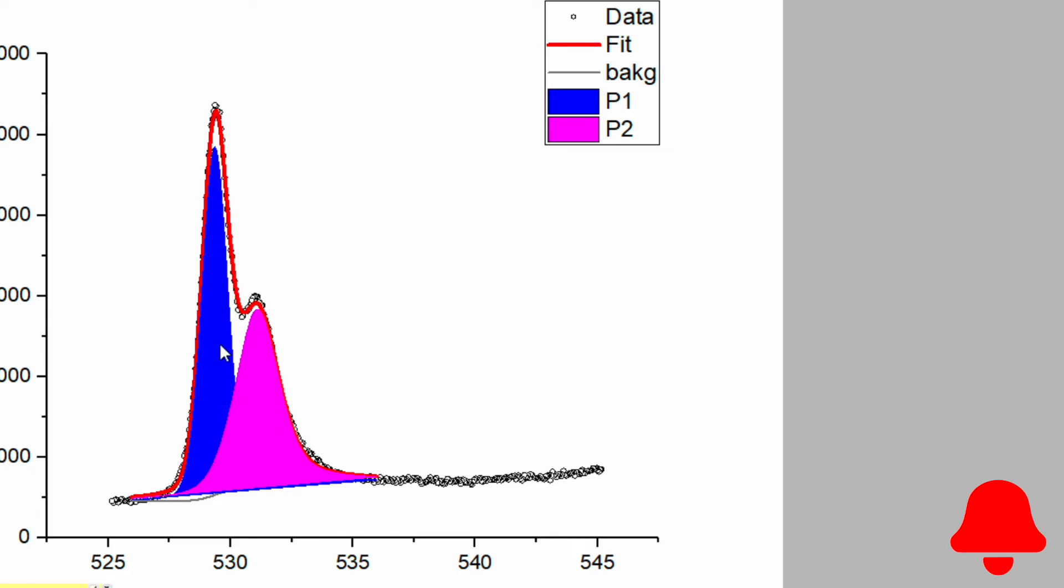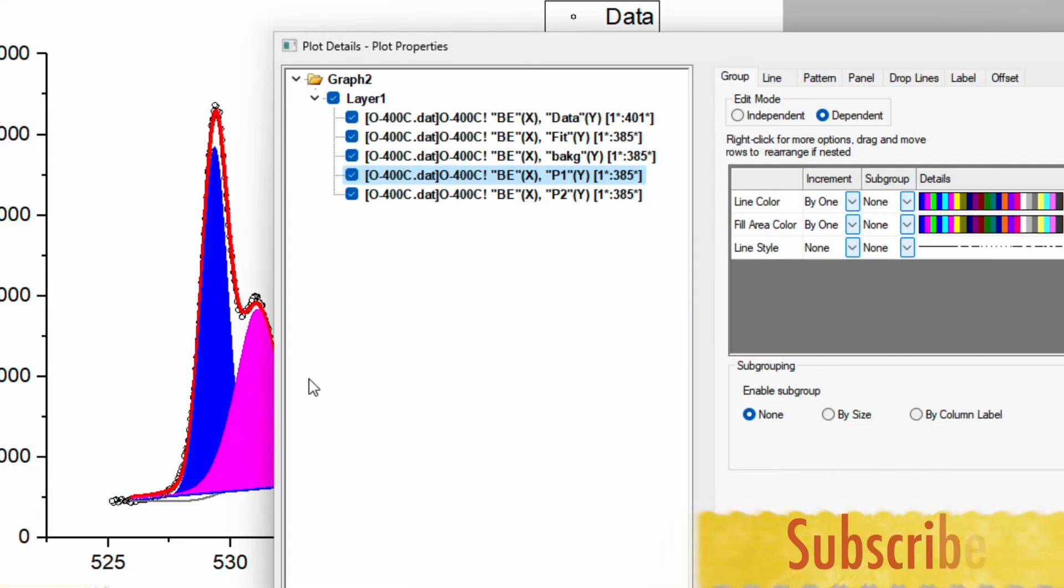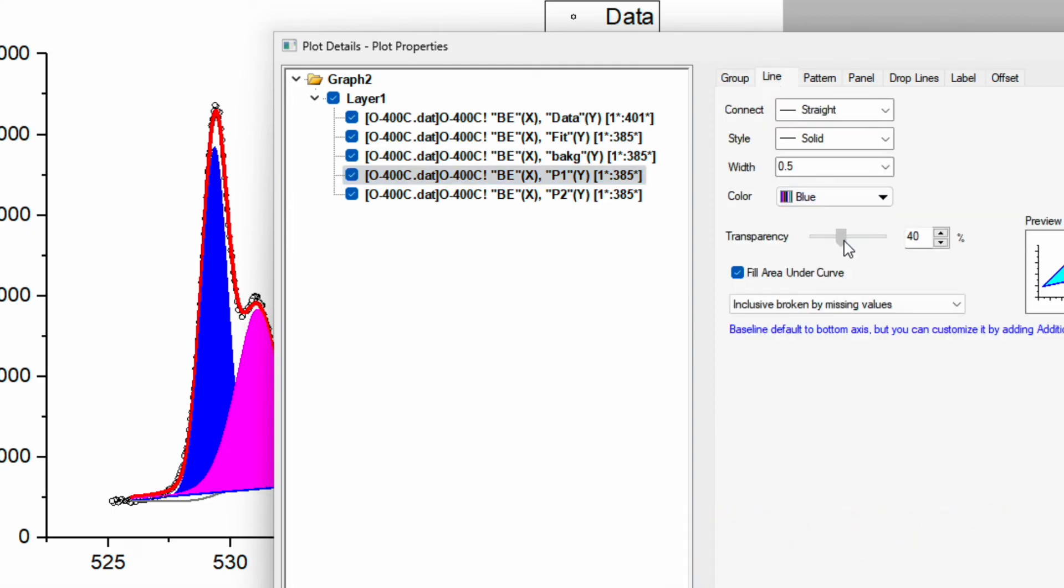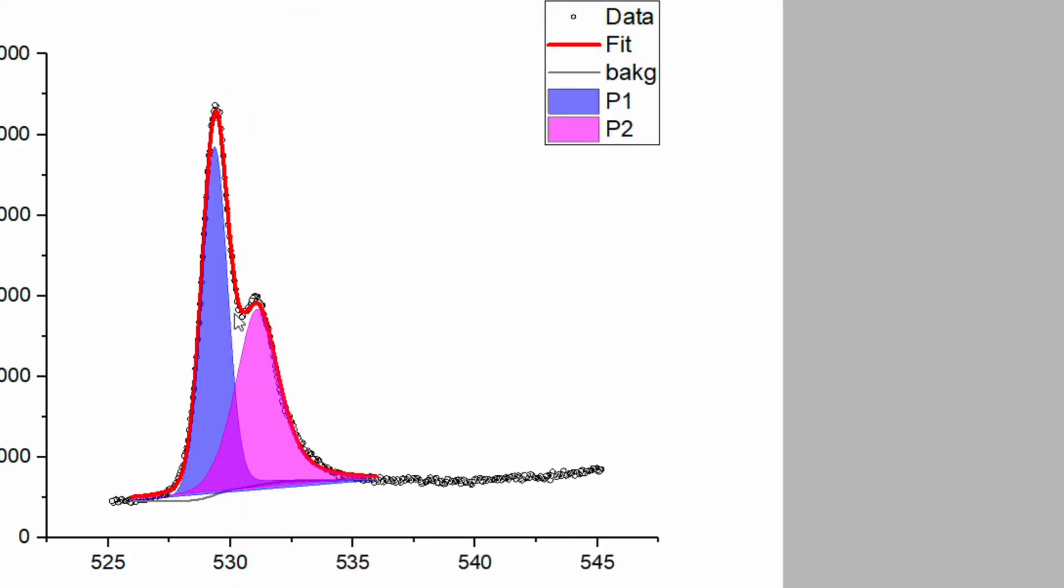Now the 2 peaks have been separated by color, but they look so dark. So double click on the pick and go to the line, and here you can tune the transparency. So choose 50 and apply again. Now you can see the area for both the curves.